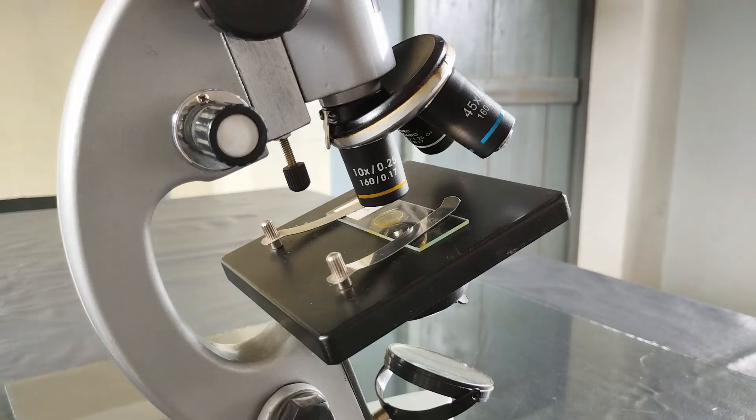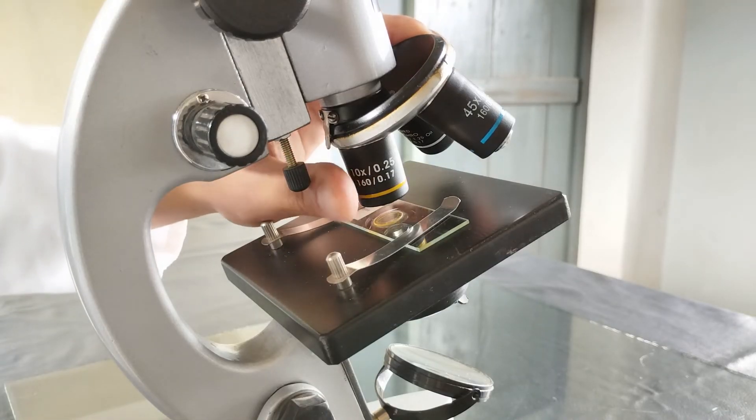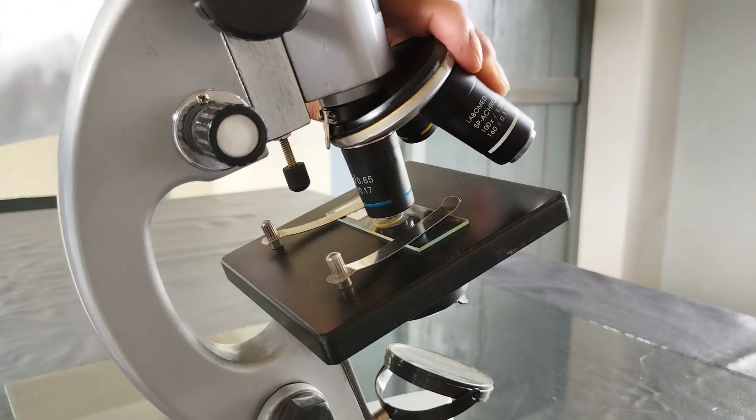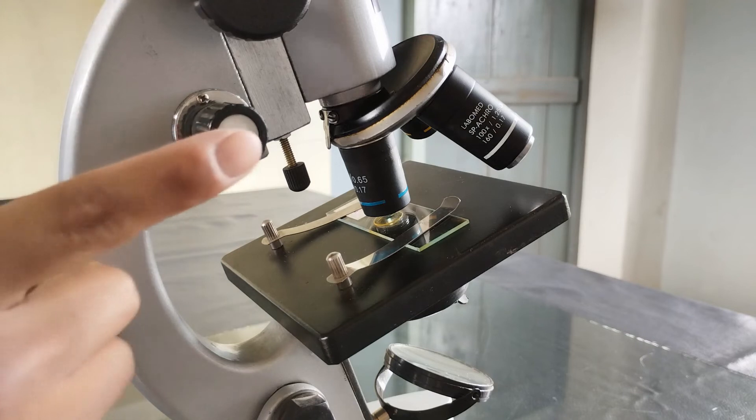Once you've locked onto the region of interest, change the objective lens to the high power, which is usually 40 or 45x, by rotating the nose piece until the high power objective lens clicks into position, aligning with the body tube. Use only the fine adjustment knob to bring the image into clear focus.